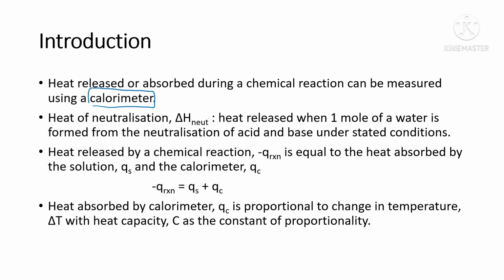In experiment 2, we are going to look at heat of neutralization, and heat of neutralization refers to the heat released when 1 mole of water is formed from the neutralization between an acid and base under stated conditions. In a neutralization reaction, heat is released by the chemical reaction between an acid and base, and the heat released is negative Q reaction and is equal to the heat absorbed by the surrounding. In the neutralization reaction, the surrounding refers to the solution and also the calorimeter.